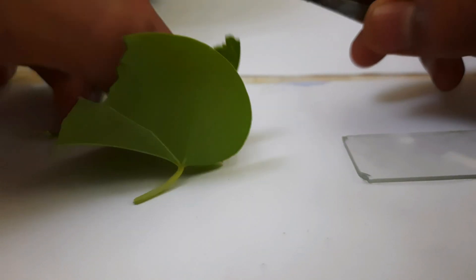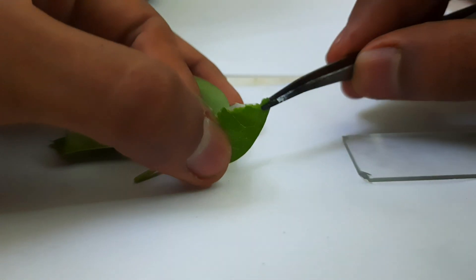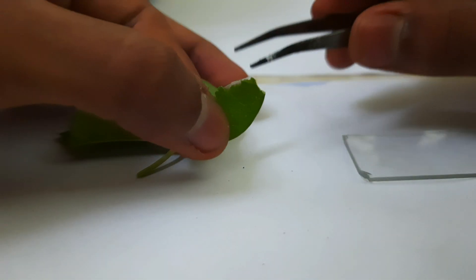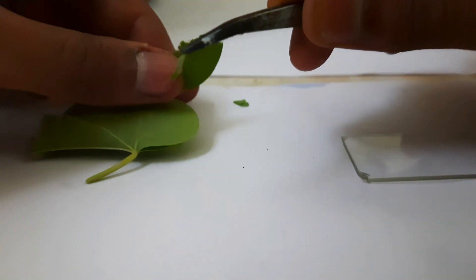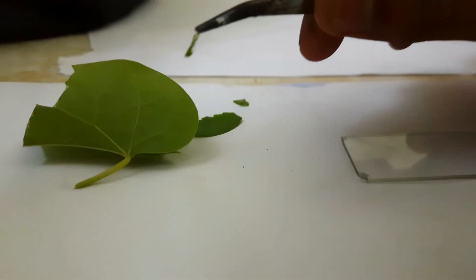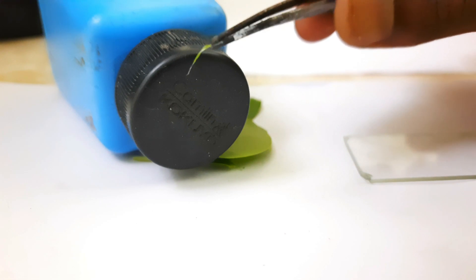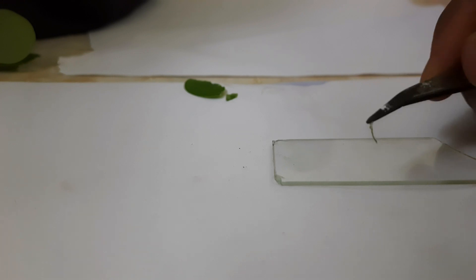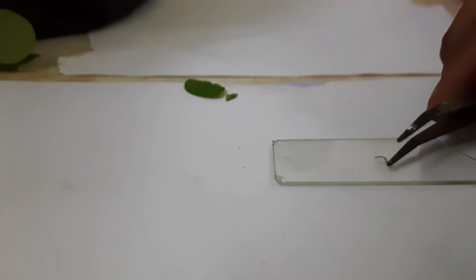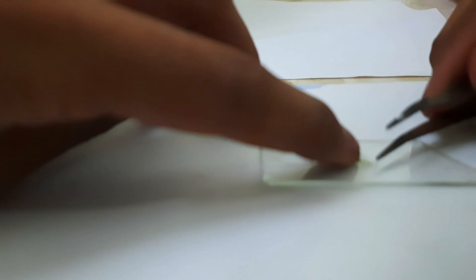I gently pulled it off with some tweezers — tweezers give a better performance in pulling a small layer off it. Here's a quick view of how the peel looks over a black cap. So let's go ahead and mount this over a slide along with a drop of water and check it out down the microscope.